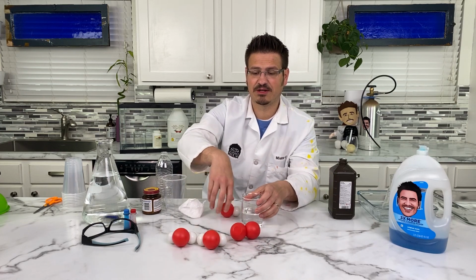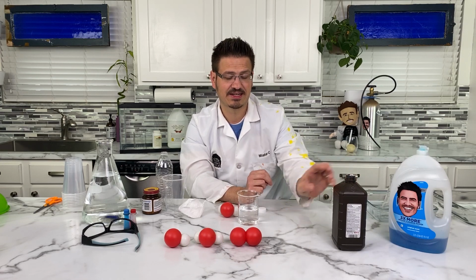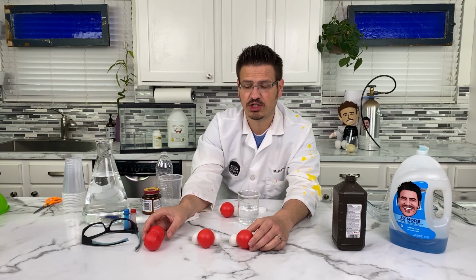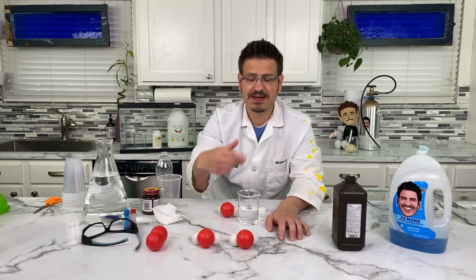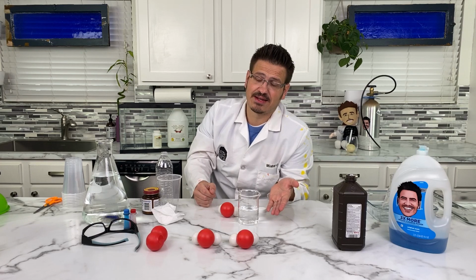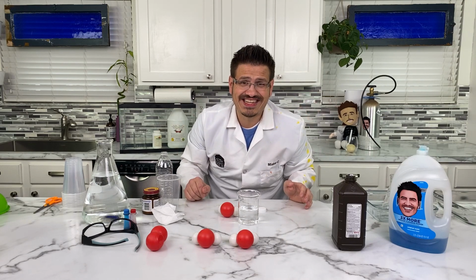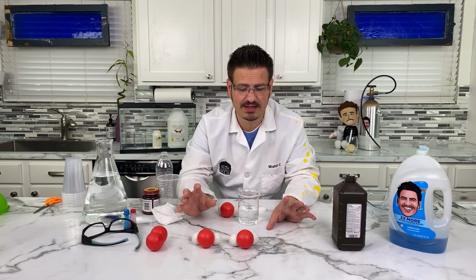Now, I didn't have enough to be able to create a chemical equation to show you, but we had our original hydrogen peroxide here, and over time it breaks into H2O and then O2, which is oxygen. So what we're going to do today is speed up this reaction, because sitting here watching this is not going to be very exciting. It's going to take a long time, and you're really not going to see anything happen as those oxygen molecules break off. We just don't see it. But we're going to try to do something to capture that experience so that we can see it together.